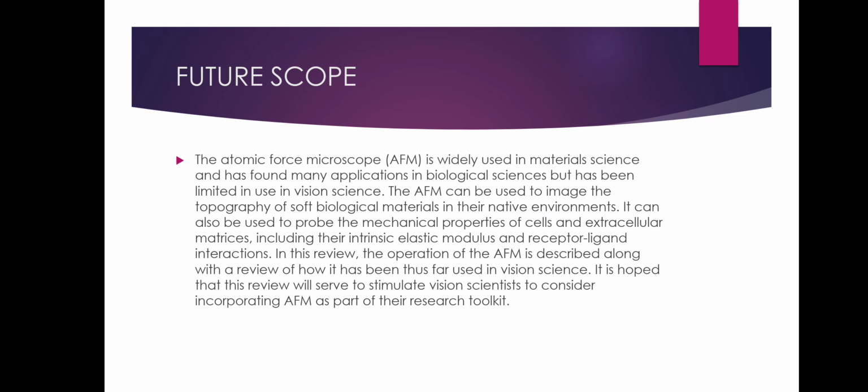So the future scope: the atomic force microscope is widely used in material science. As we discussed earlier, the atomic force microscope gave us the image of very small particles. So it has great value in material science, and it also has many applications in biological science, since we can see all the smaller stuff.